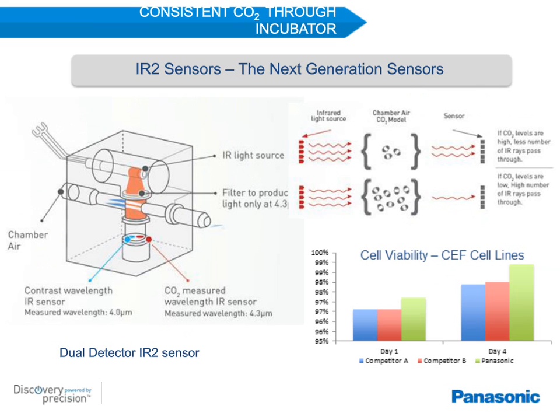In our sensor, IR radiation, so infrared radiation, is directed to the sensor after passing through a filter, and a filter in front of the detector prevents wavelengths that are not specific to CO2 gas from passing through the detector. From there, the light intensity is detected and converted into a gas concentration value. Every IR sensor relies on the principle that every gas will absorb at a specific frequency. In the case of CO2, it'll absorb light at 4.3 micrometers, which is in the infrared band of the light spectrum.